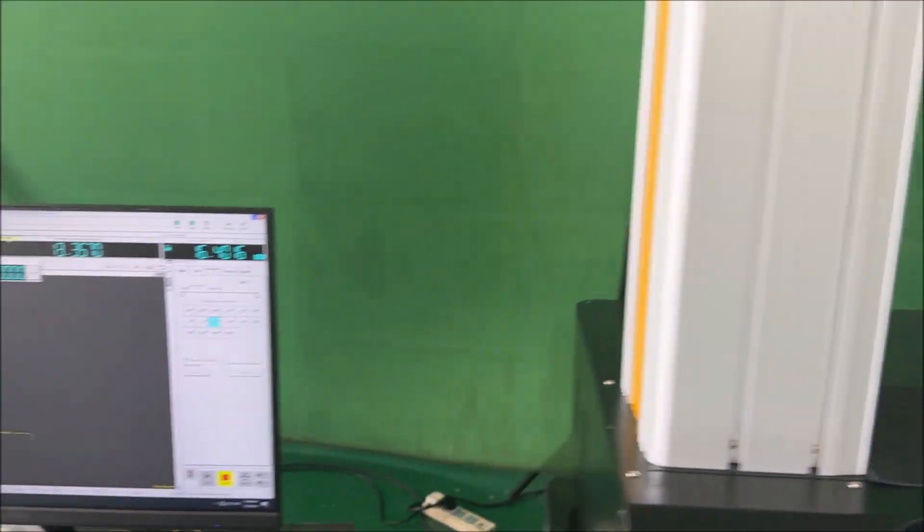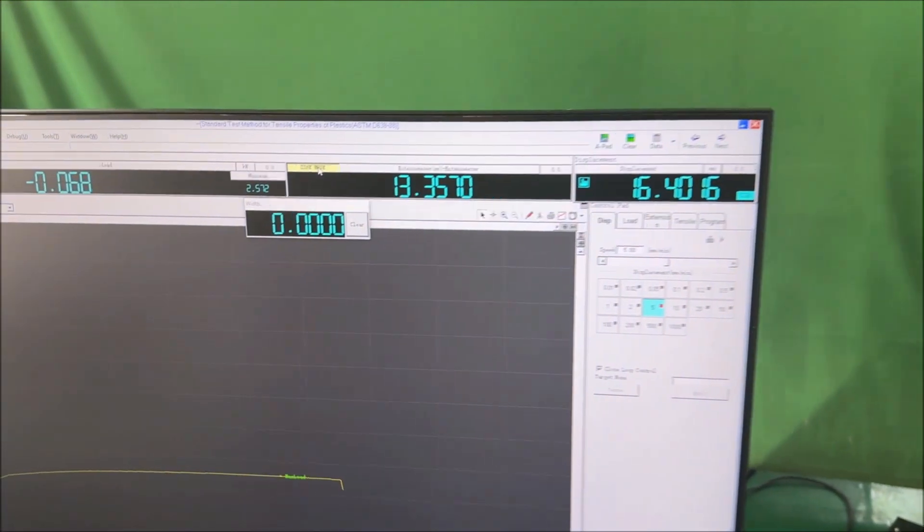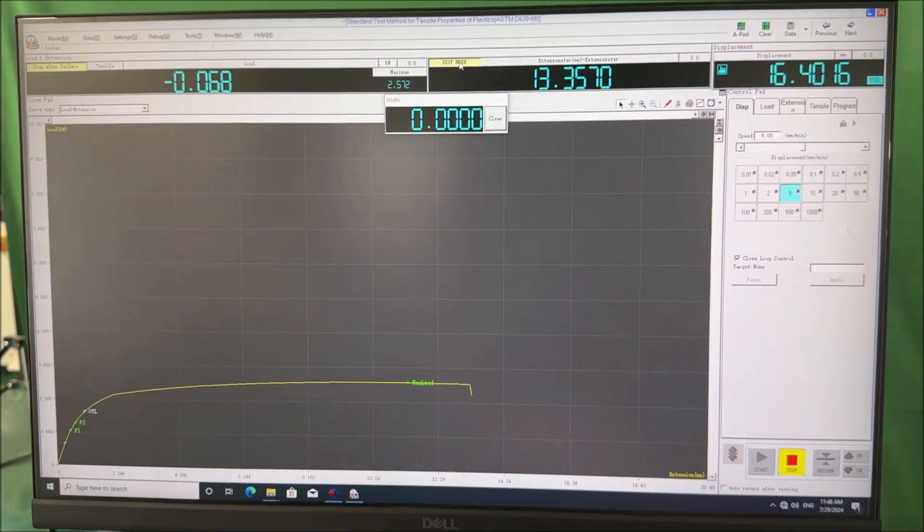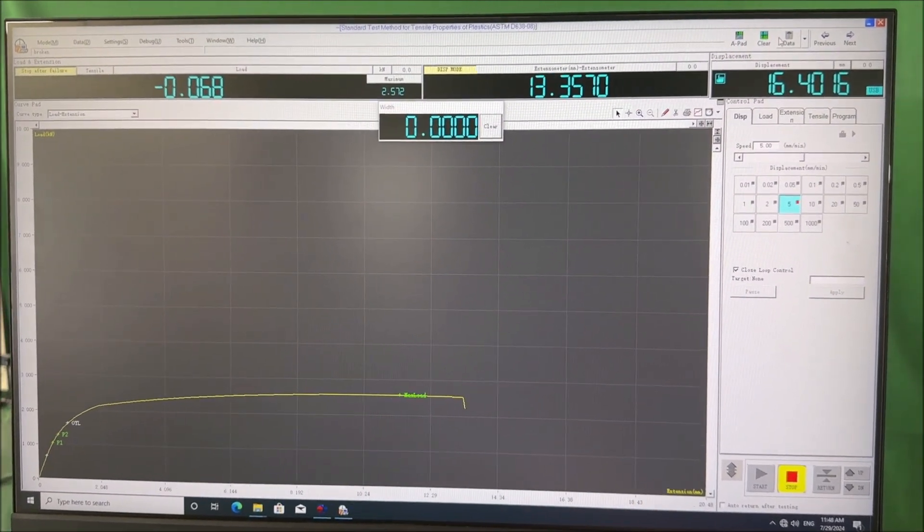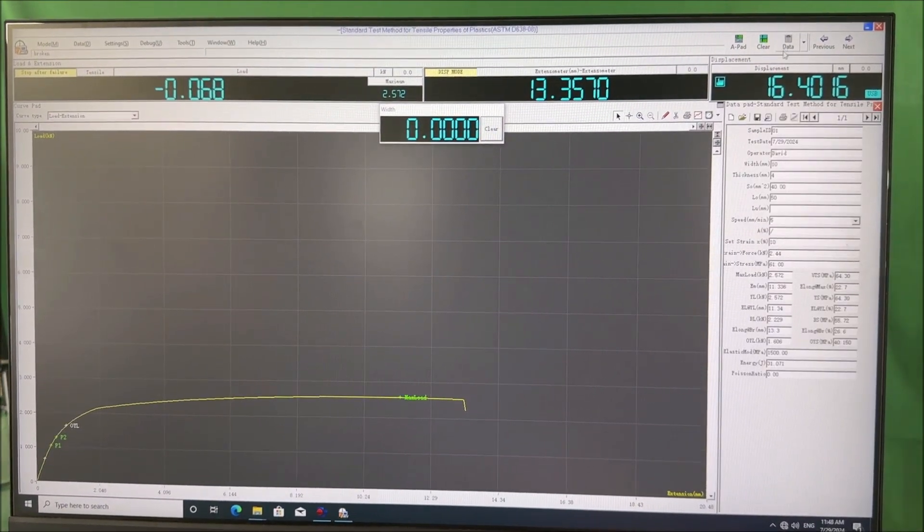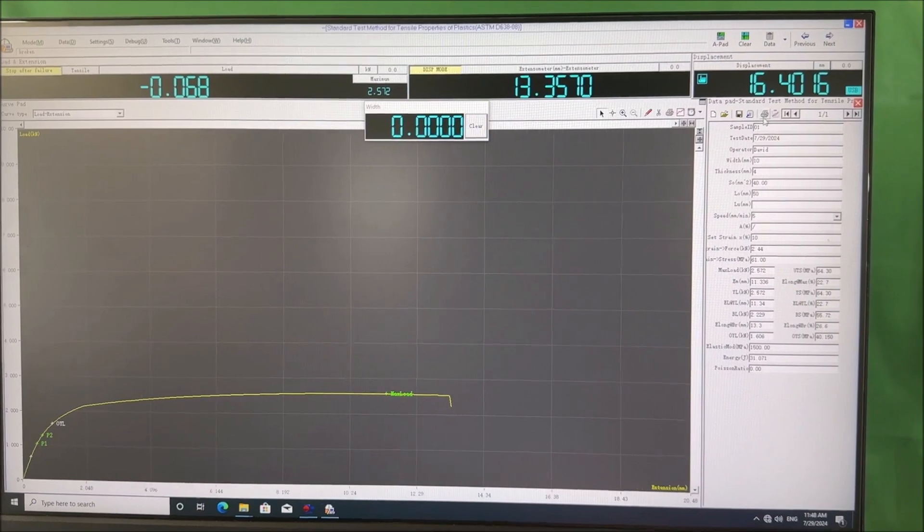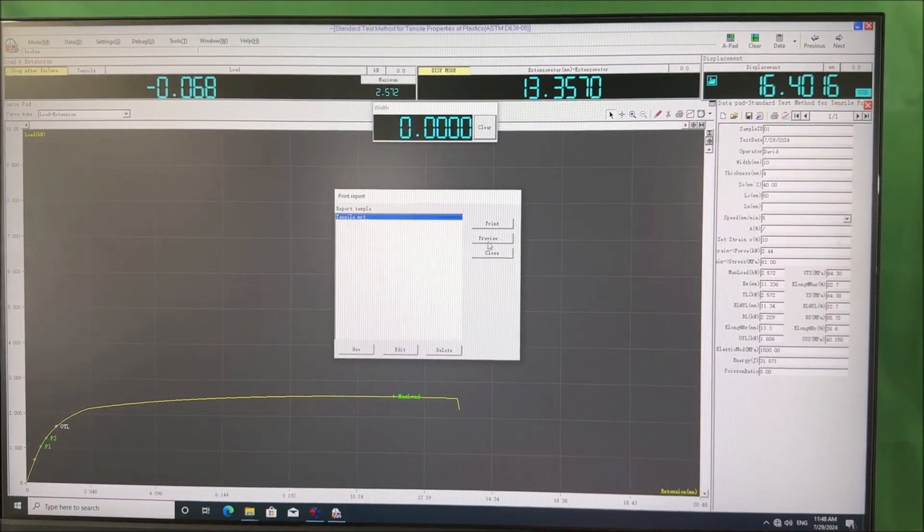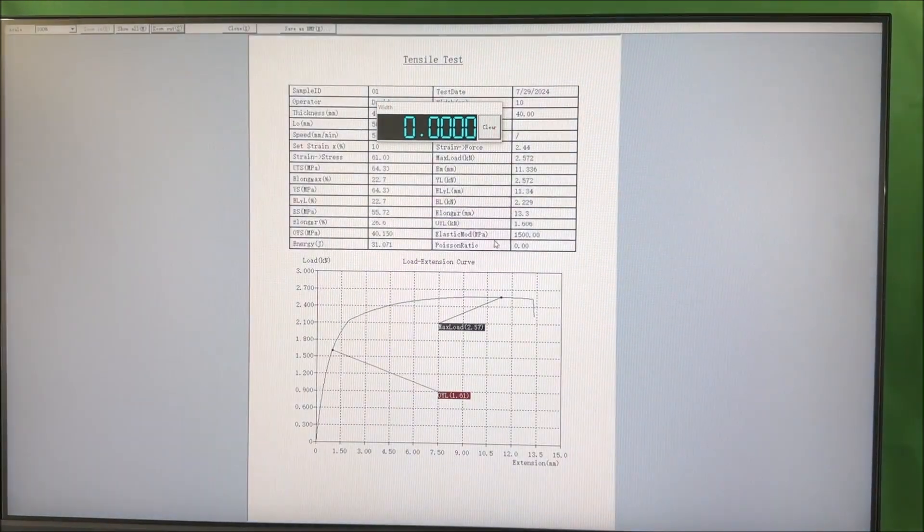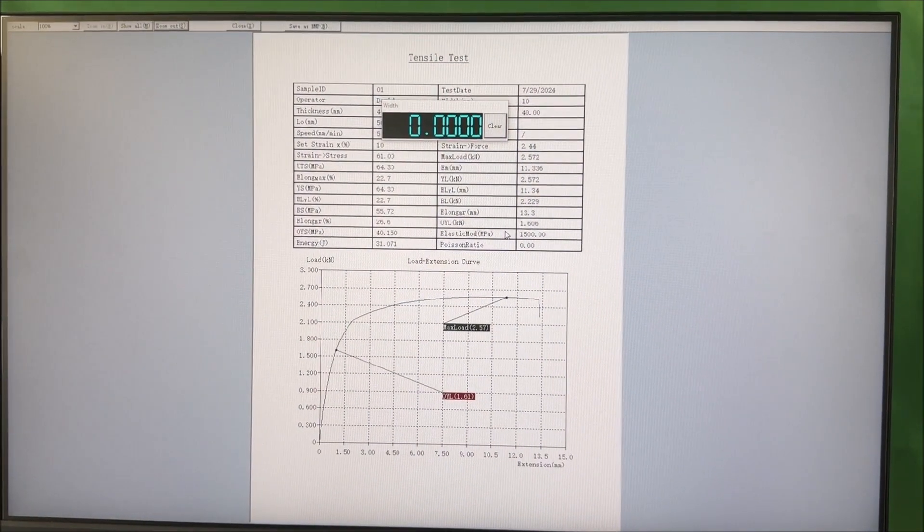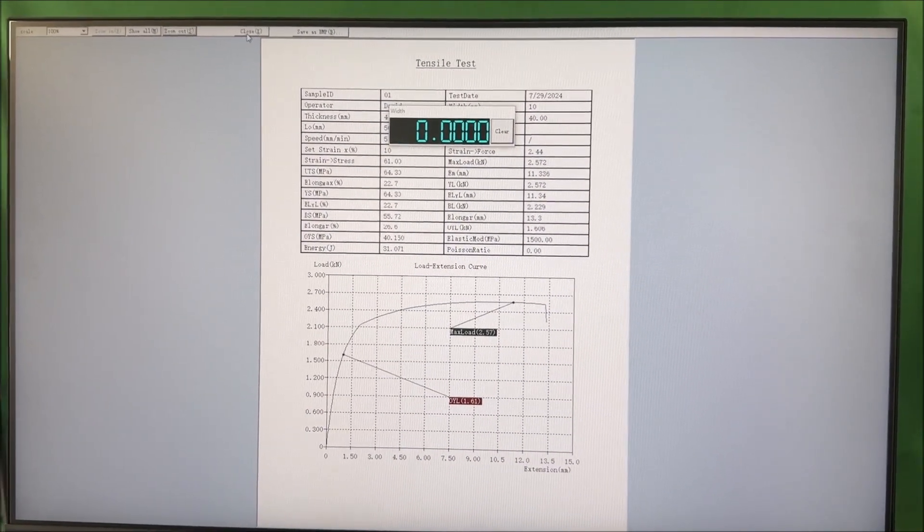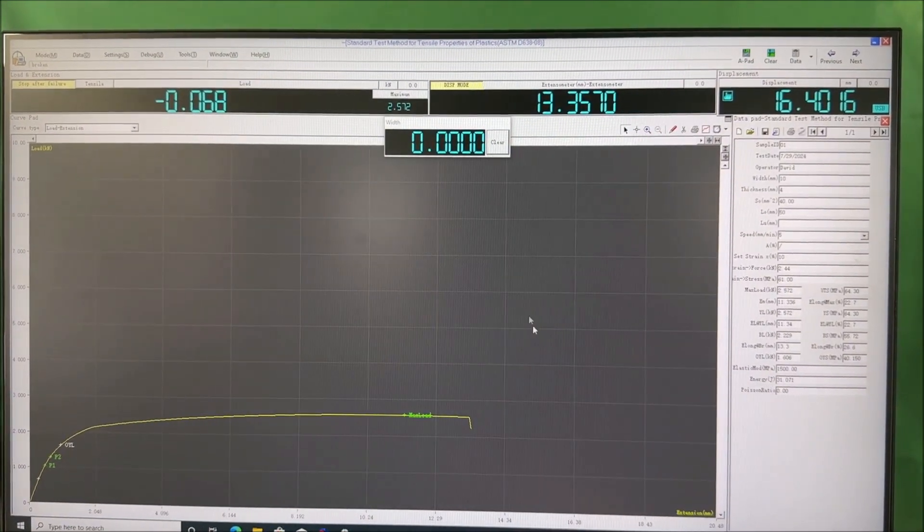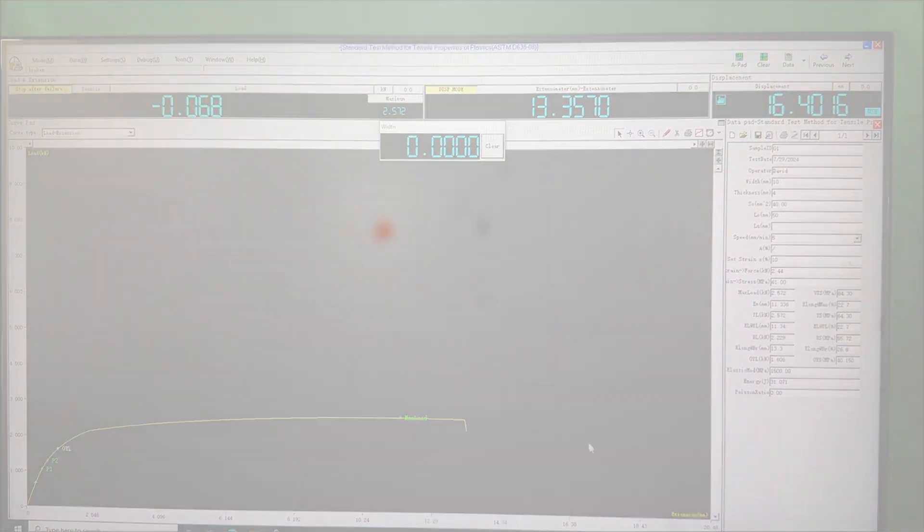The 50 kilonewton universal testing machine comes equipped with user-friendly software to streamline the testing process. The ASTM D638 standard is pre-programmed into the software, allowing operators to select it effortlessly with a simple click.